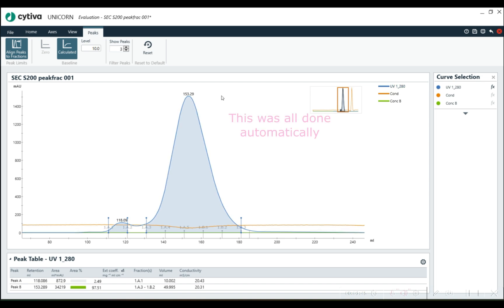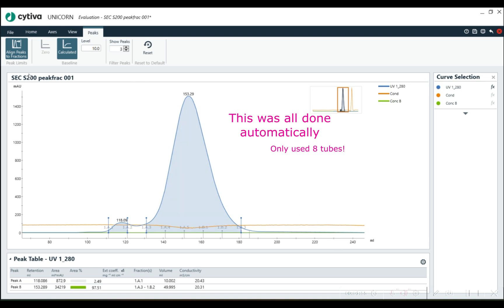You notice that as soon as the UV goes up, we start collecting fractions, and once the UV goes down a certain level, it stops collecting fractions. We don't waste any more fraction tubes after that.